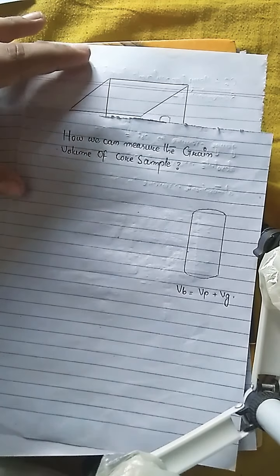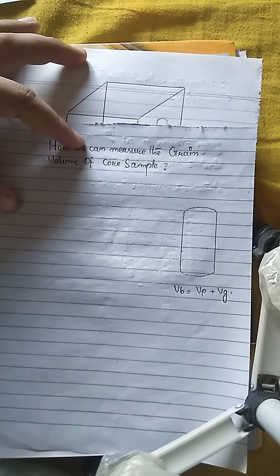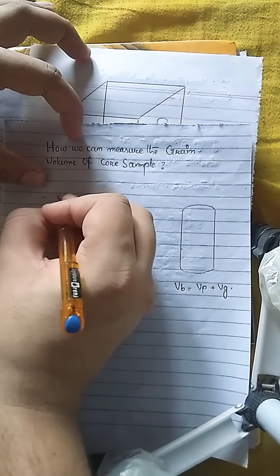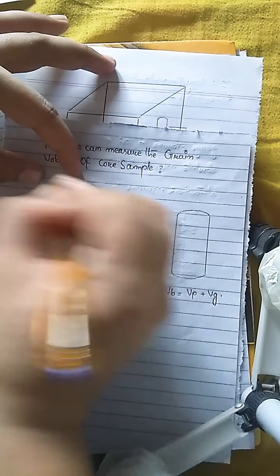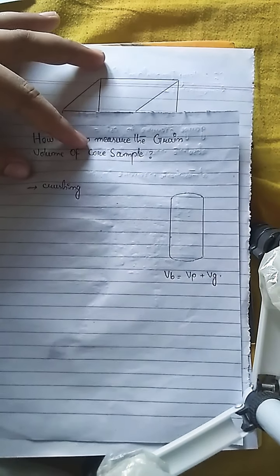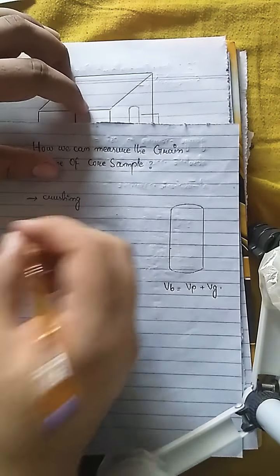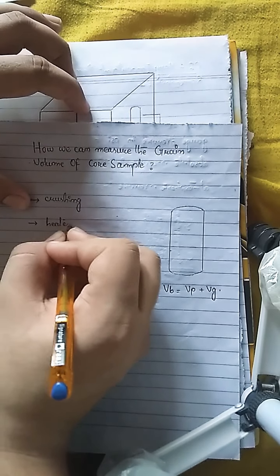Now let's move to how we can measure the grain volume of the rock sample. In order to measure the grain volume of the core sample, first of all we crush that core, the core whose grain volume we need to know. First it is crushed and then it is heated. Why do we heat the core sample?